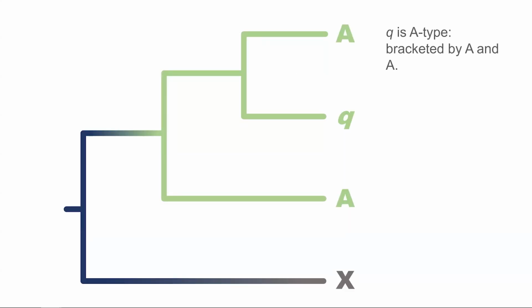And the main point: probably most people here are familiar with the concept of using a reference tree and placing sequences on the reference tree to annotate those sequences. In most cases it's easy, because if your query falls into a clade, it's clear it's a member of that clade. But I thought the more interesting cases are the ones where it falls outside of any clade. And that can mean two things. It could mean the program is wrong, but it also could mean that we actually have a first representative of a novel subtype, which is useful.